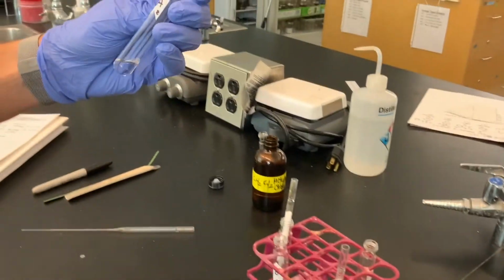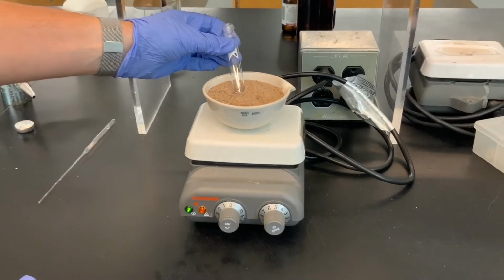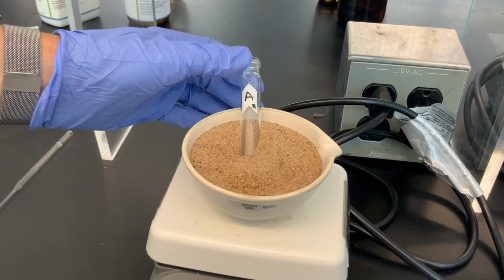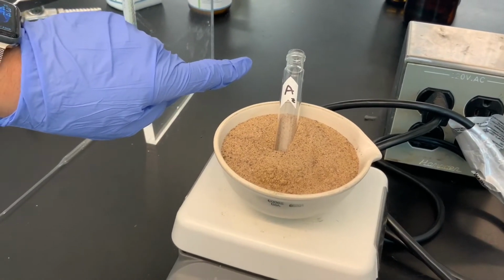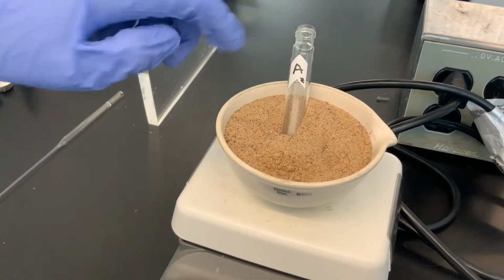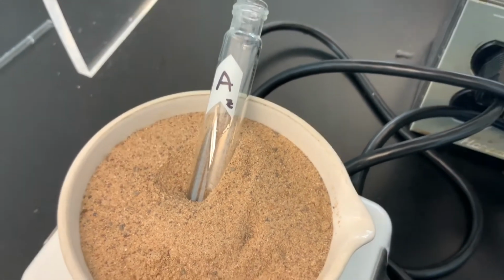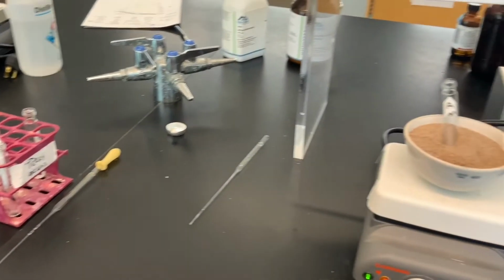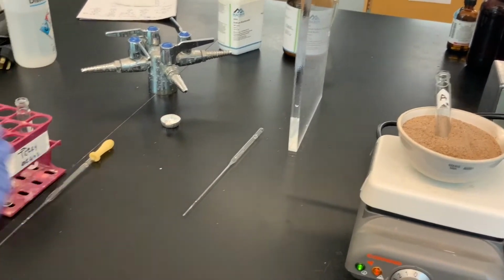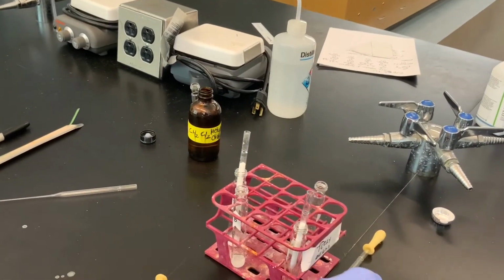Right. So this is part A in this tiered culture tube, and now we're going to just leave it in a hot sand bath. Aim it away from us just in case the methylene chloride starts to boil in our face, but you can already see that it's boiling. Its boiling point is 39.6 degrees, and so it should evaporate away pretty readily, and then we'll see that there'll be the solid residue of benzoic acid left over. Once again, we're expecting to see less in part B.